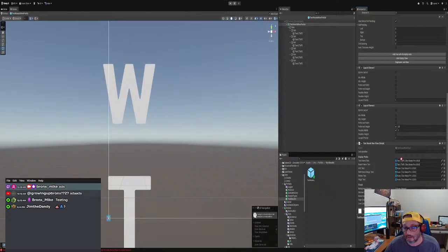You may want to change the names to this because sometimes you get confused. So I got 1, 2, 3, 1, 2, 3, 4. Let's start from the back. 4, 5, and 6. Okay. All right, so that's it, right?